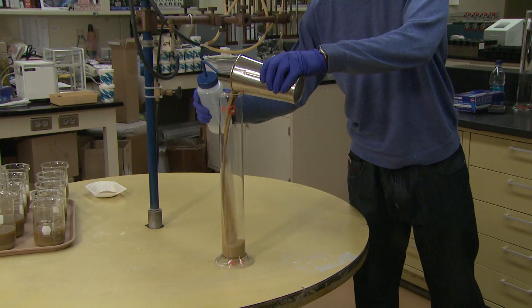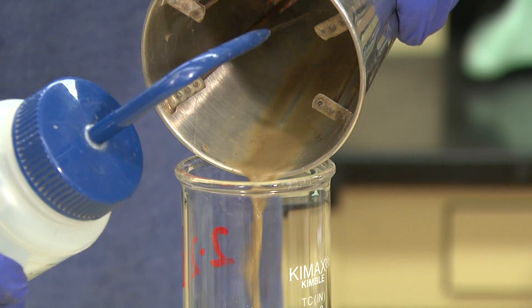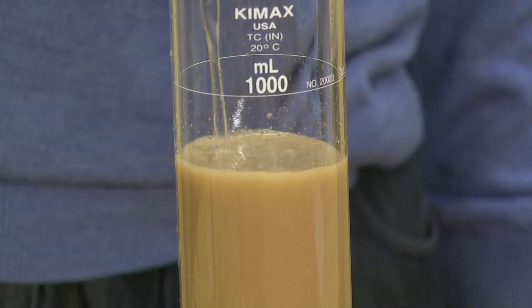After stirring, the sample is poured into a 1,000 milliliter cylinder, again making sure to rinse all soil particles from the cup into the cylinder. The cylinder is then filled with distilled water up to the 1,000 milliliter line.